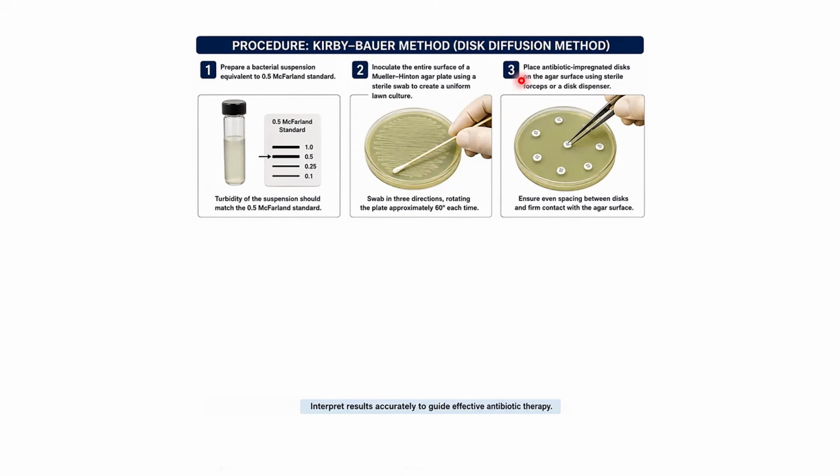So after doing this, we place our antibiotic-impregnated disc on the agar surface using a sterile forceps or a disc dispenser. And in doing this, we must ensure even spacing between the discs and firm contact with the agar surface as shown here.